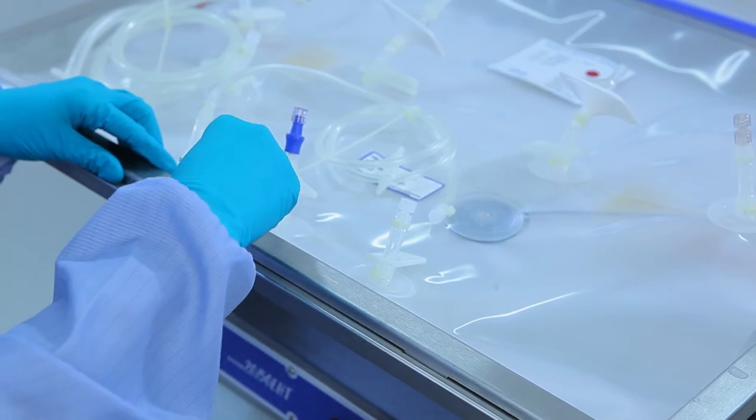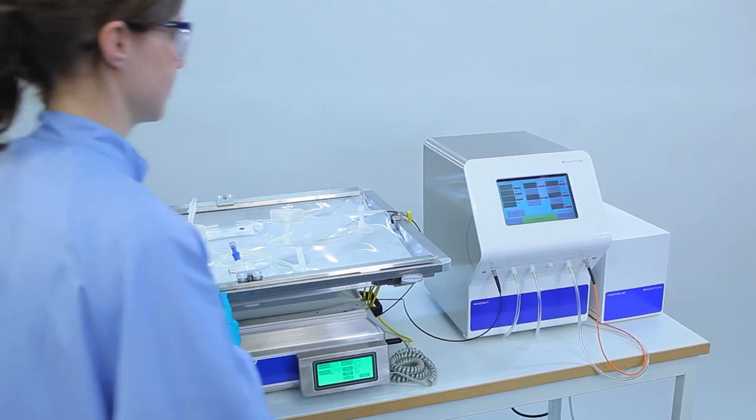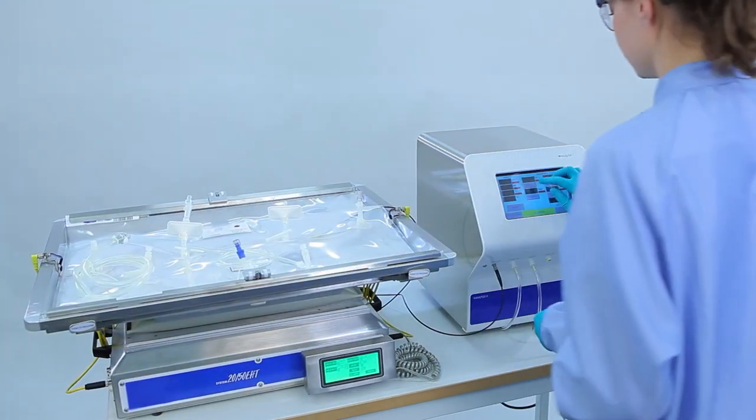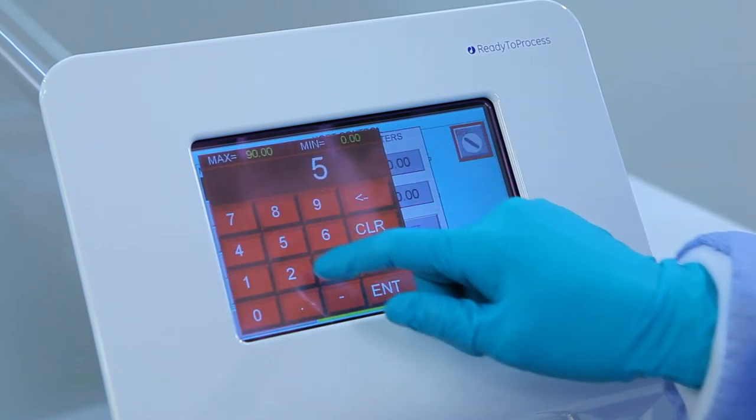To avoid deterioration of the sensor, protect it from strong light. Enter the calibration values for the pH sensor via the optical pH control screen on the WavePod 2.